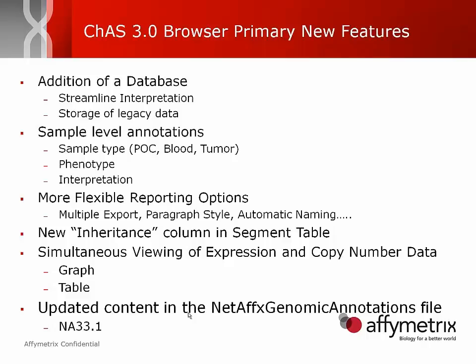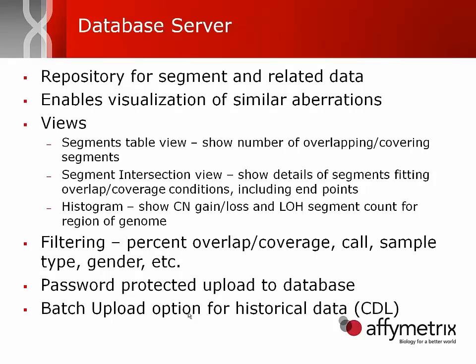All right, let's delve into this database. It is a Postgres database. It is a repository for your segment data, as well as any sort of related data, meaning any sort of annotations at the sample level and at the segment level that you've put into the chip file.